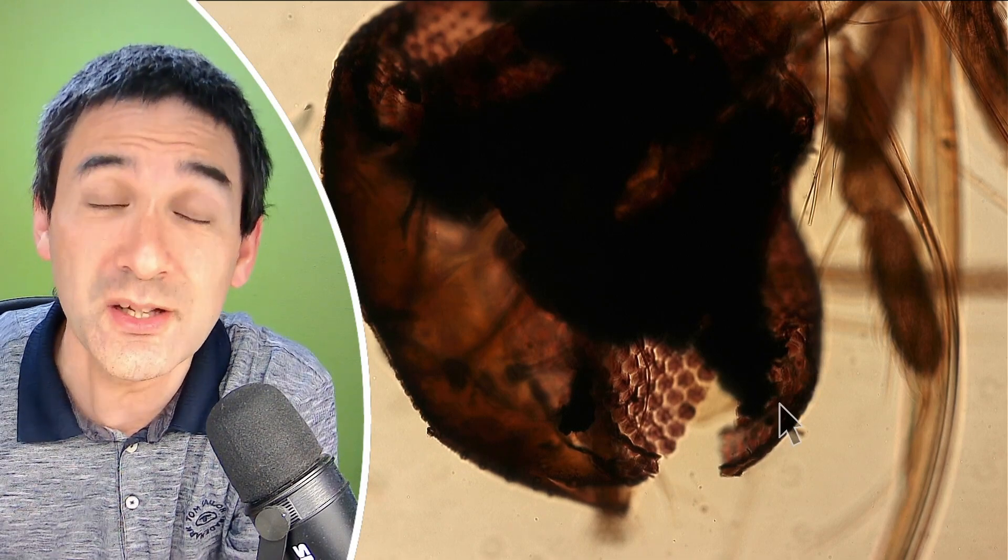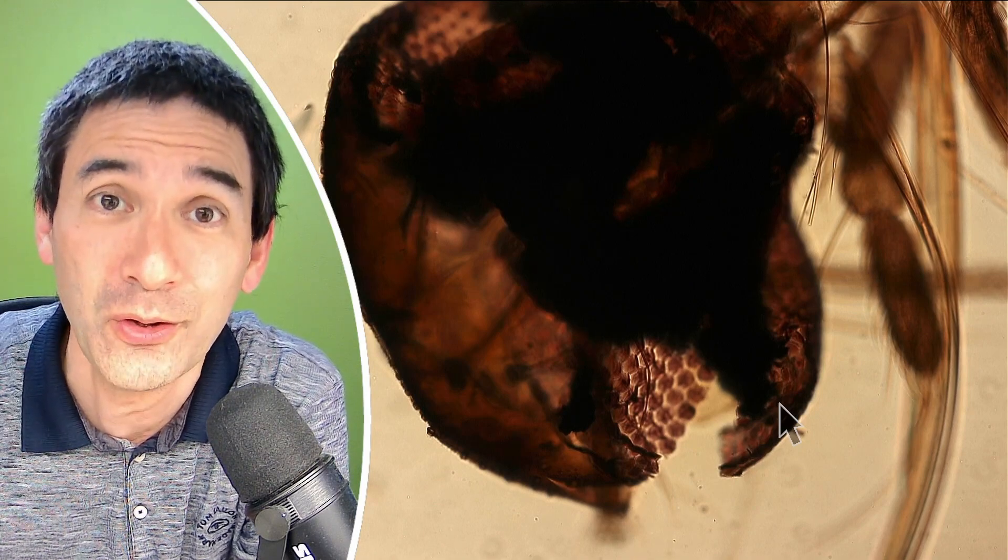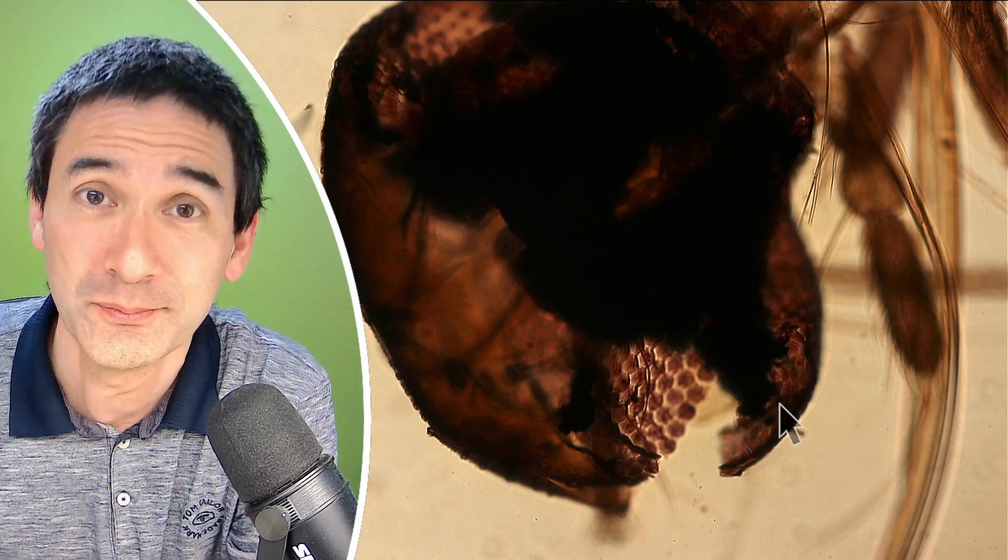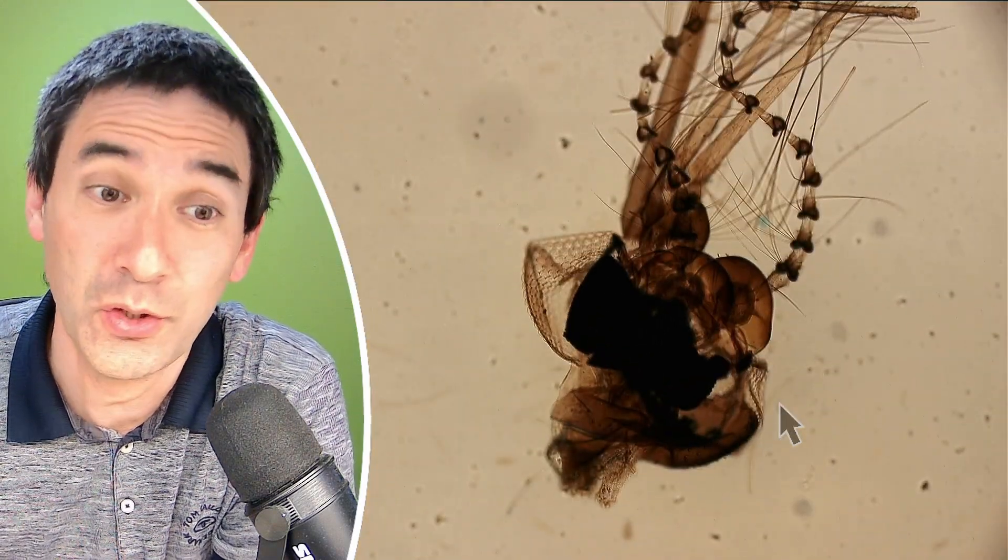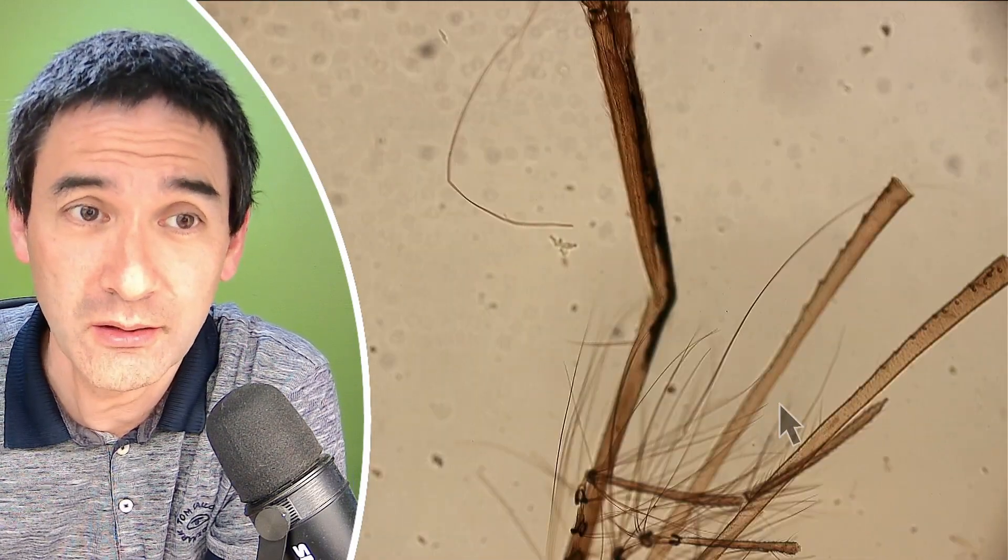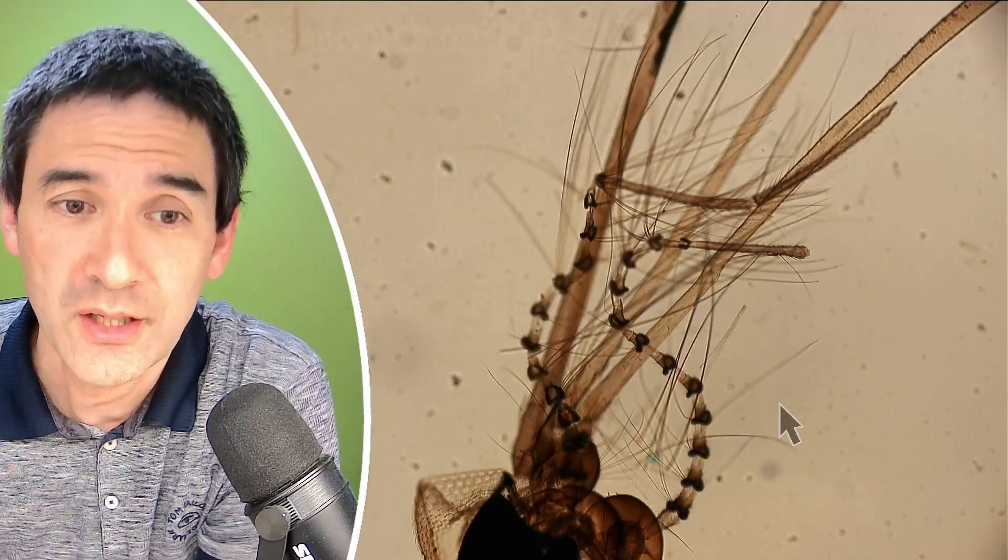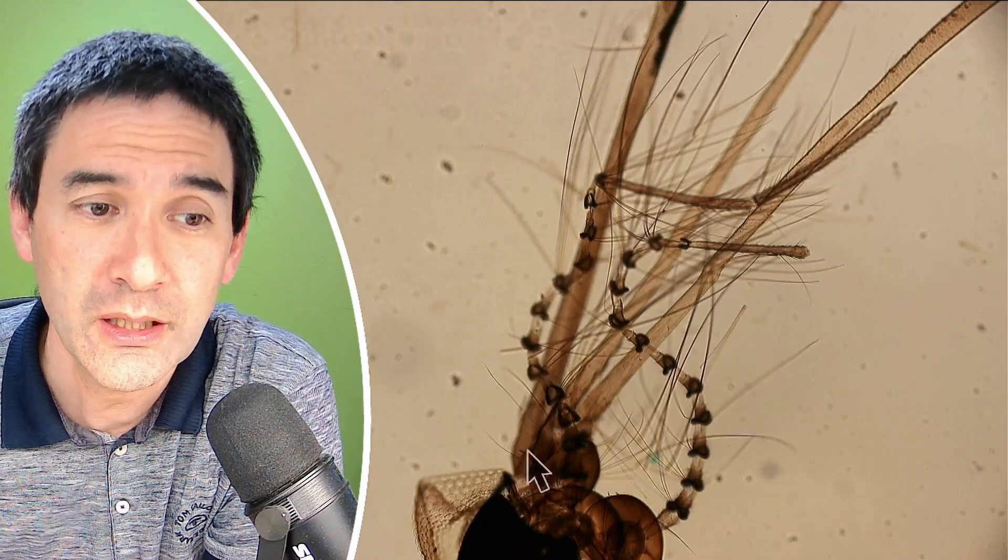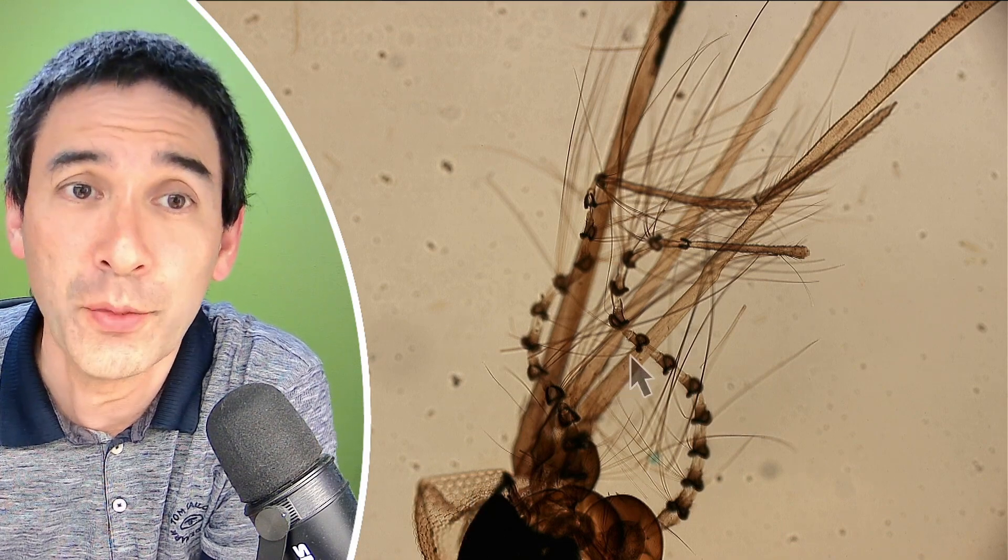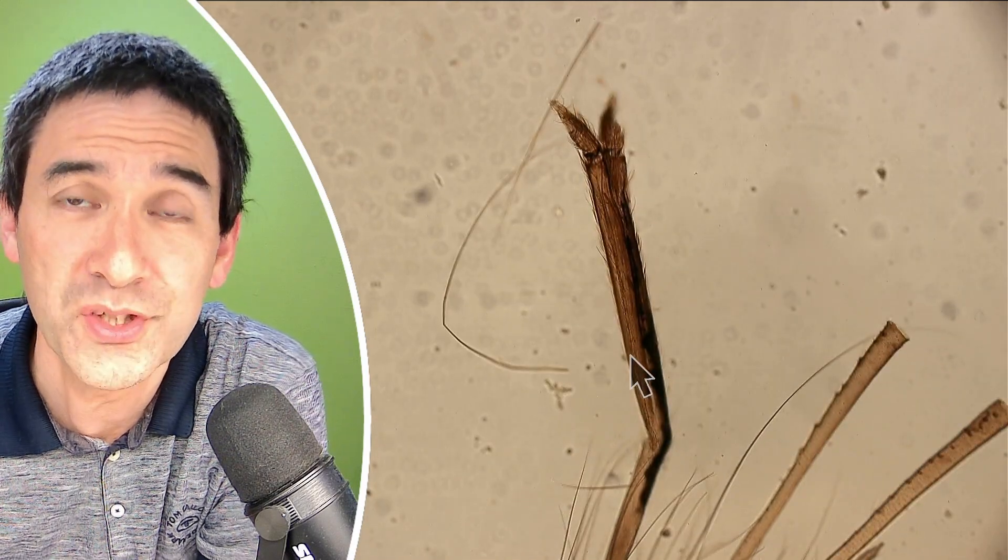What about males? Well, males also have a long proboscis, but generally they do not suck blood. They feed on nectar and on sugar solutions, basically provided by the flowers. And here it is. So it's the head of a male, also a commercially prepared microscope slide. Not very nice looking, the preparation. But at least we're able to see all of the relevant parts here. We can see the antenna, of course, over here. Again, the compound eyes are down here. And then these long extensions, the mouth parts, which in this case are not important for sucking blood, but for sucking nectar.